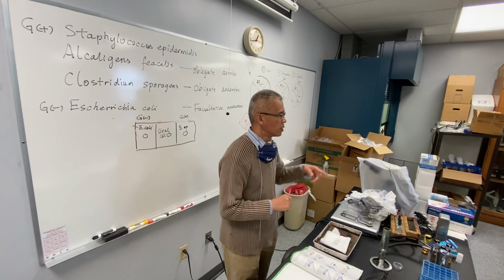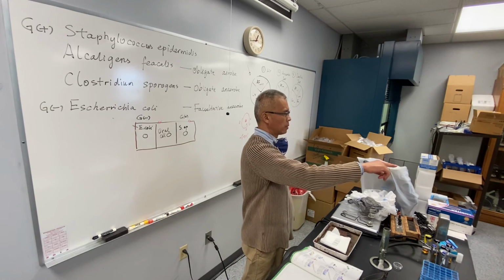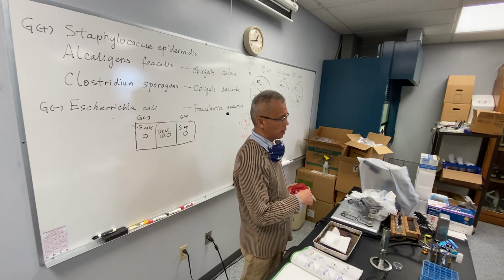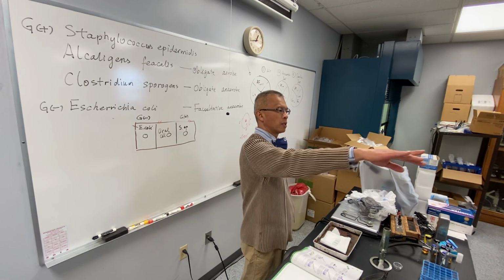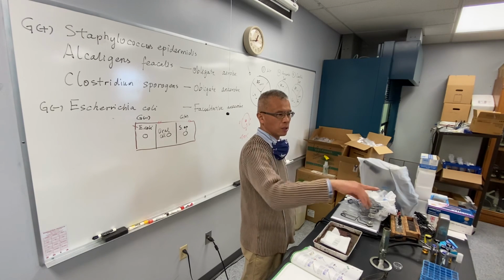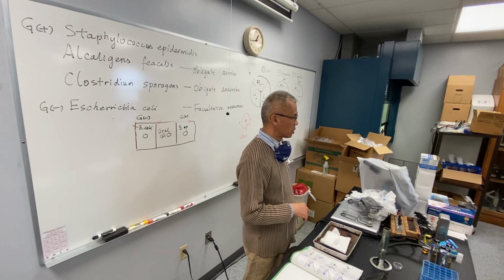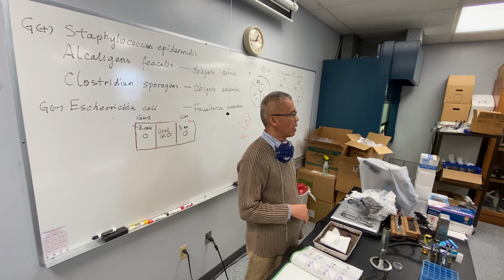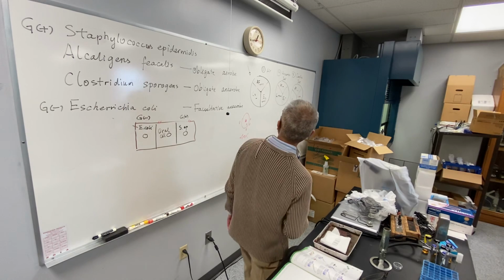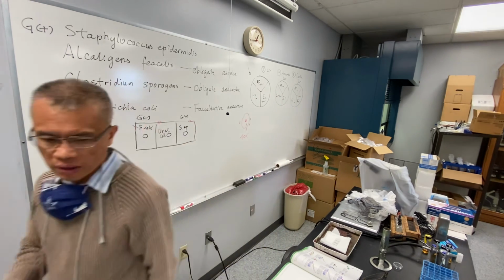And over there we have E. coli plates and S. epidermidis plates, and each one of you has your own plate, slides, and coverslips, everything. And you see on the table 3 bottles in front of you, the solutions of crystal violet, iodine, and safranin, right? Any questions? Okay, let's go ahead, we're just 15 minutes past. Let's get it done in the next 40 minutes.